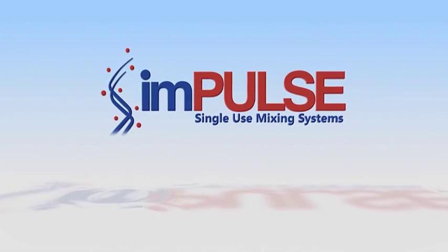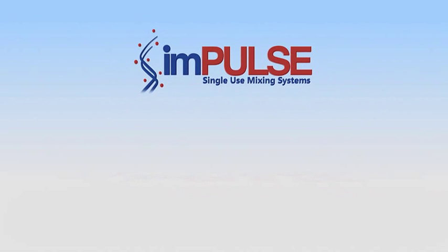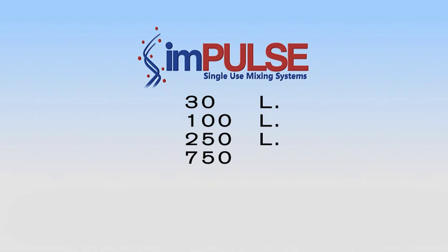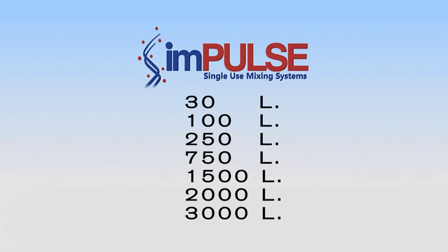Impulse single-use mixing systems are available in 30, 100, 250, 750, 1500, 2000, and 3000 liter capacities.